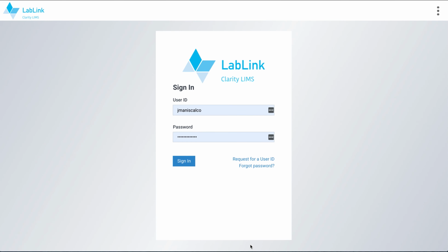We're going to review one of the 3 ways to accession samples into Clarity LIMS. This video will demonstrate how to use LabLink, which is a client sample submission portal, to batch upload samples into a project.